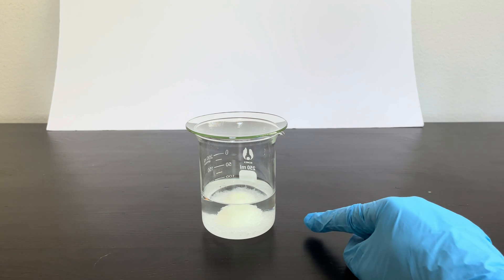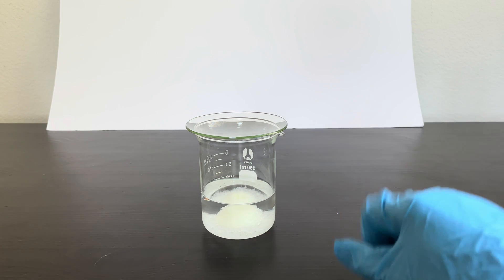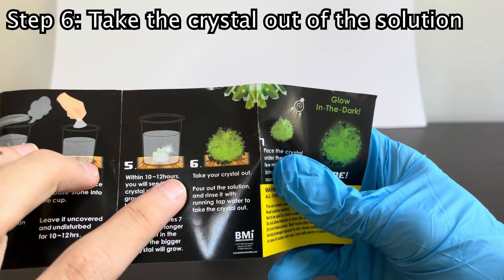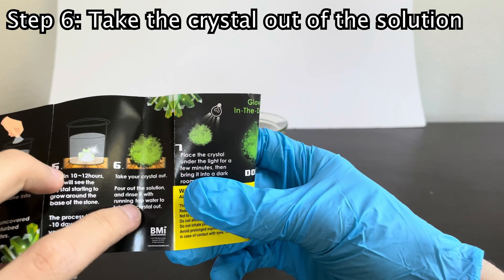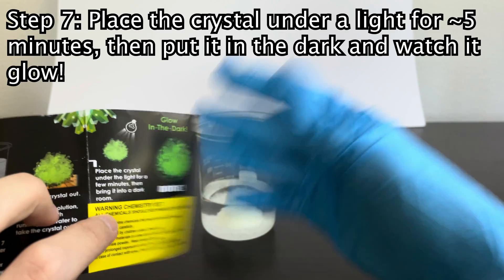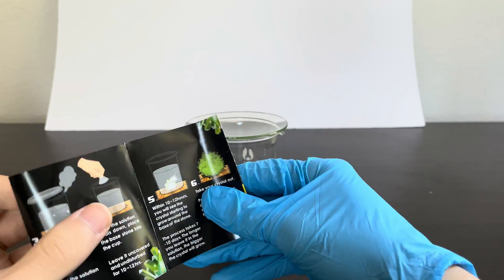So now that this crystal has been sitting here for about a week and it's grown to its maximum size, we can take it out and complete the final steps in the directions. We need to take the crystal out, pour out the solution, rinse the crystal with some water, and then place the crystal under a light and bring it into a dark room to see it glow in the dark.